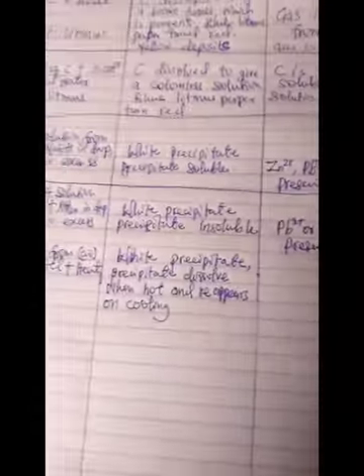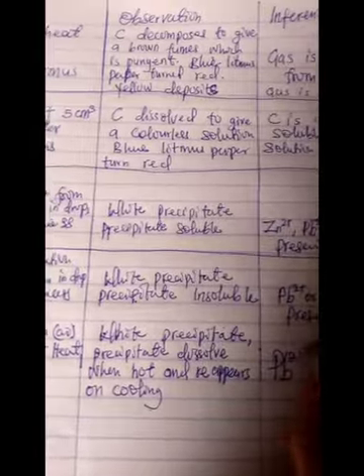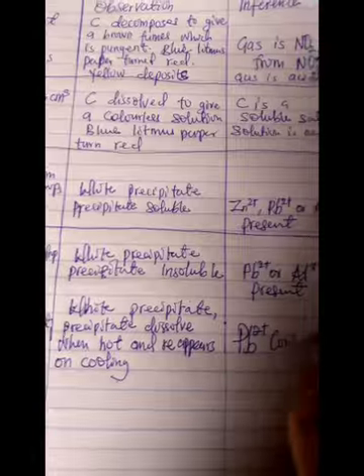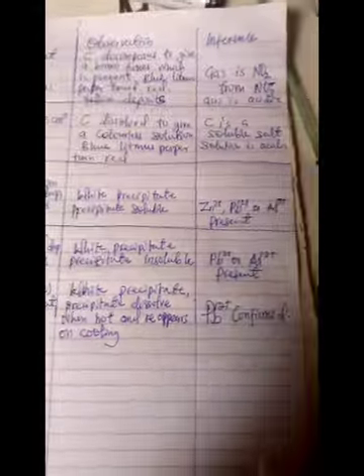So the precipitate dissolved when hot and reappears on cooling. And the only one that does that is who? Lead. So we have confirmed it. Lead is now confirmed. Lead 2 ion confirmed. So we are through with C.